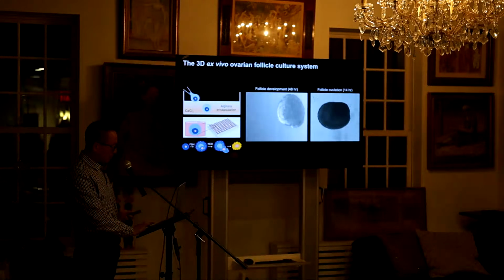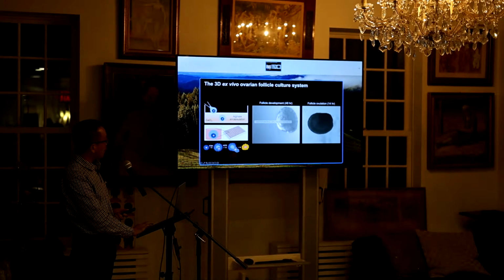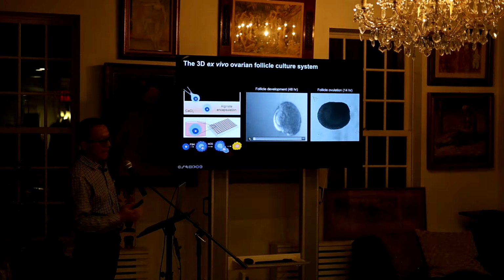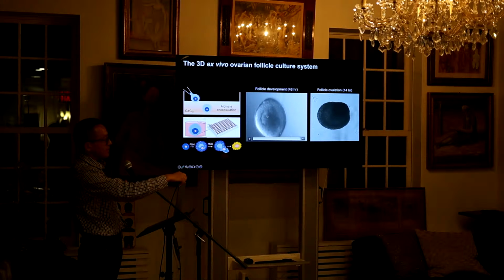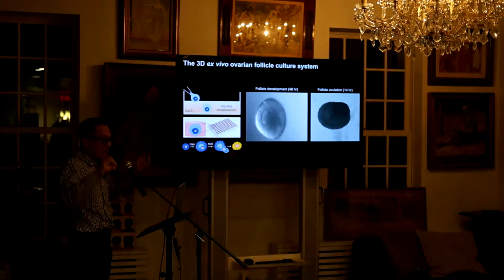Here I have two videos. The first video is about 48 hours of follicle culture time, during the FSH stimulation. When you stimulate the follicle, you can see the granulosa cells on the outer layer keep proliferating. Now the oocyte, I still don't know what is happening in the oocyte. It's something there, it's changing, partly because they produce a lot of proteins, maternal effect factors, and they also increase in size to become fully mature.